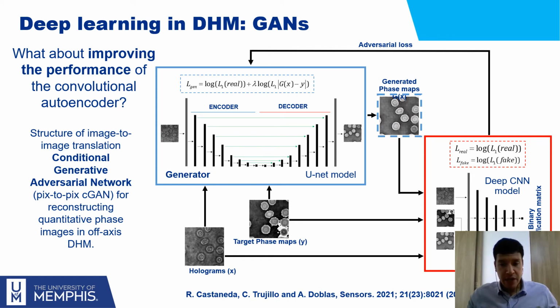For our particular network, we are using a conditional GAN, that is a GAN that not only produces signals, or in this case images, no matter the input, but the input to the generator must be somehow related to the output of the generator. So the generated images are mapped directly to a given input. That's essentially the first distinguishable characteristic of these conditional GANs.